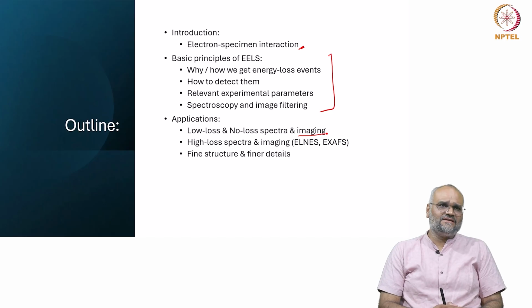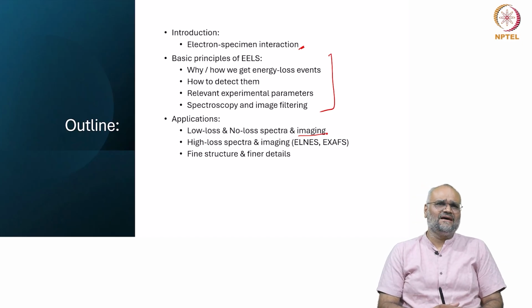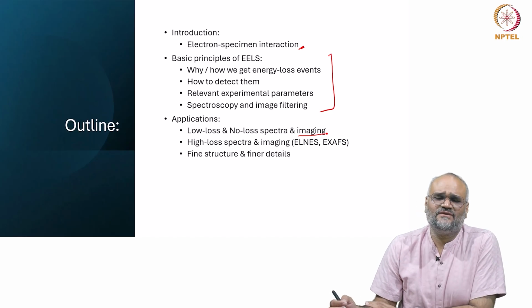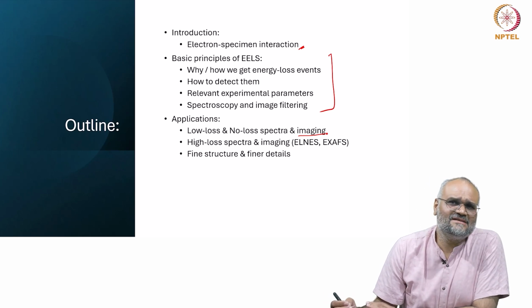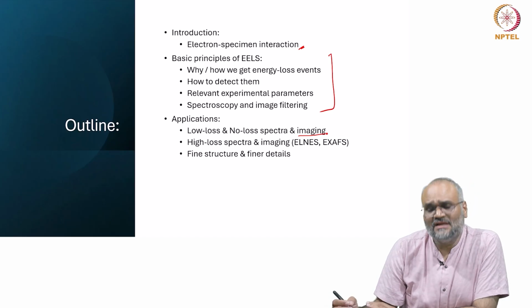The omega filter, which is available in systems like the 2200 FS or the Zeiss Libra, predominantly can be used for this, and I'm aware that there is the SALVE project which was developed at the University of Ulm. They were building a very low energy TEM coupled with a low energy spectrometer. This is primarily focusing on beam sensitive materials as well. So there's a lot happening in this particular area as well.